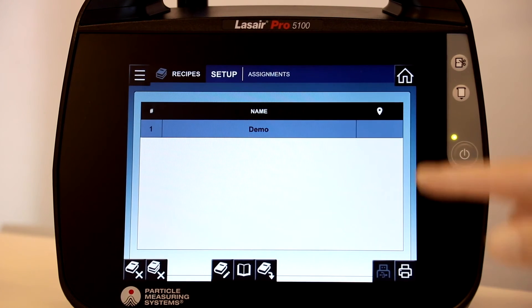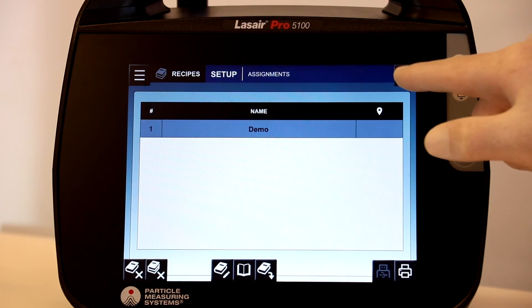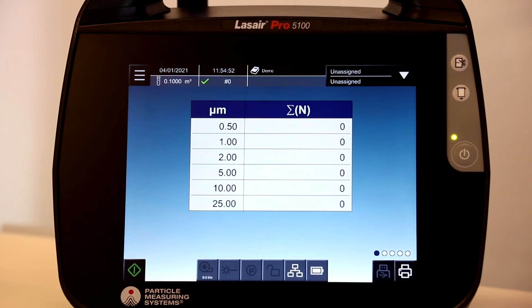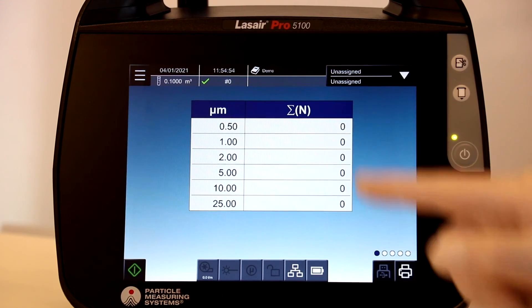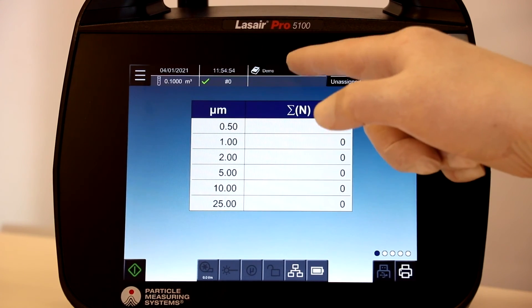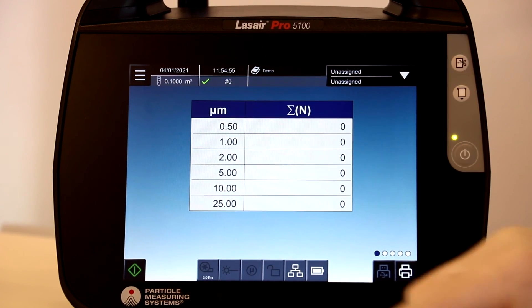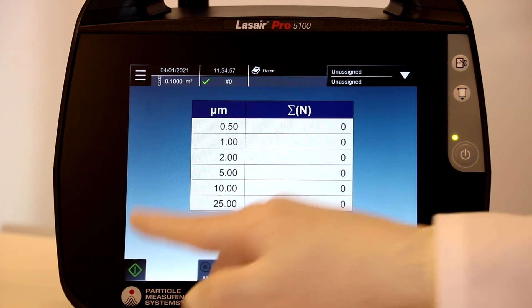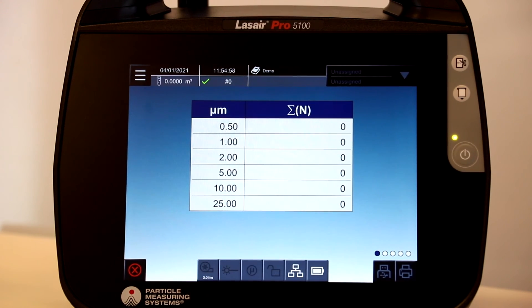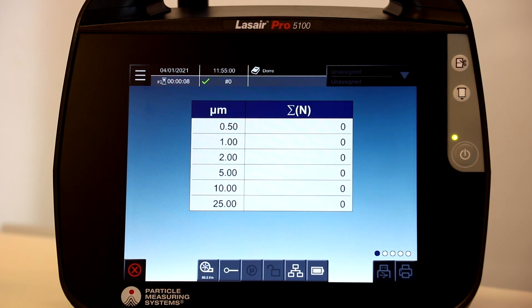To run the recipe, simply navigate to the home screen. Here, you can again confirm the correct recipe has been loaded. Now, to run the recipe, simply select the Start Sample icon to begin sampling.